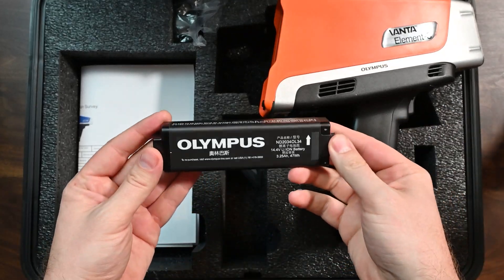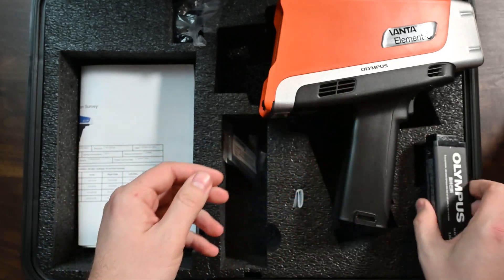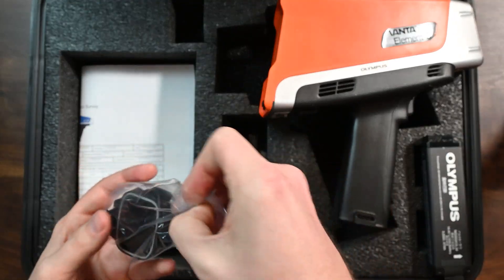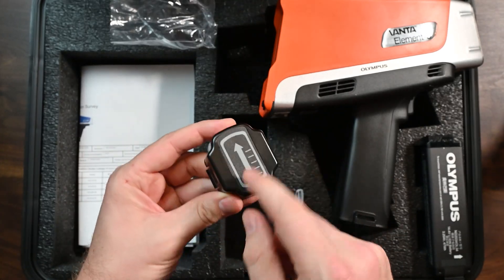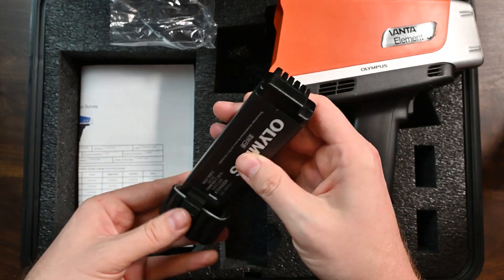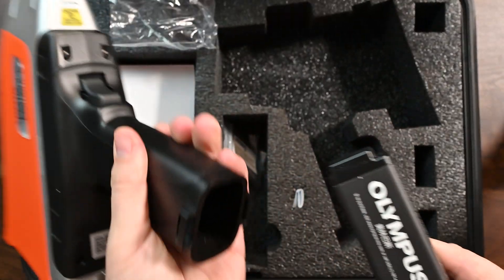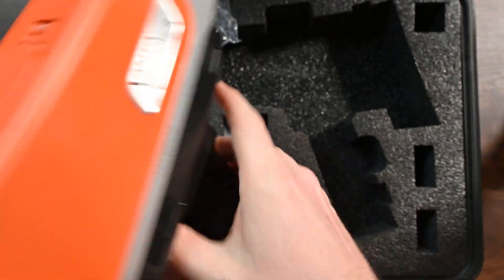We get one battery with the Vanta Element S. You can find more of these batteries on alageek.com — they're pretty easy to come by. I recommend having at least two batteries, if not three to five, if you have a big facility. The battery cover is a separate part here, and you'll see it has an arrow that tells you how to align the battery. You just put the battery in the base like that, and then the arrows point to the front of the analyzer and clip that in.